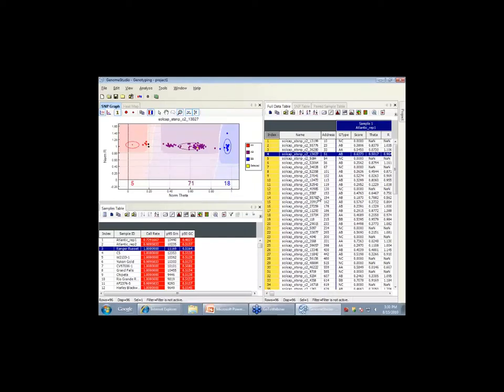It's going to put the data in the context of the predefined clusters that somebody else did in that cluster file. So that's actually a very important thing to know. For example, we'll have 8,300 markers in our Infinium array. You don't want to go through 8,300 markers. Let one person do it, and then everybody use that data set. So that's something really important to know. It won't be in the help file, but it'll be in the SolCAP file, exactly. Of course, you have the option of saying, I didn't really like what SolCAP did. You can move those around later yourself. Your data may look different than ours as well.